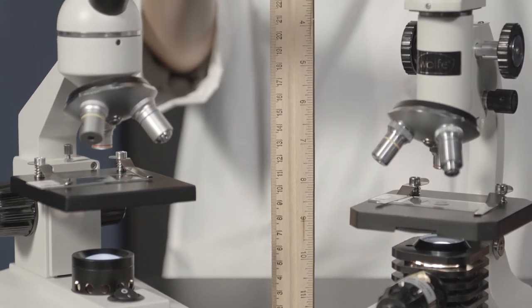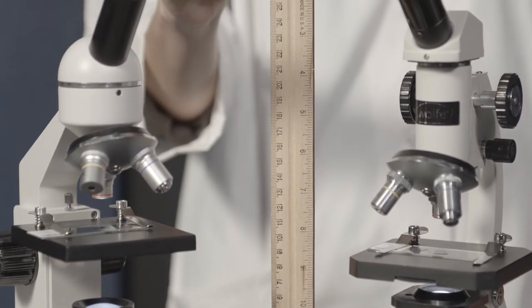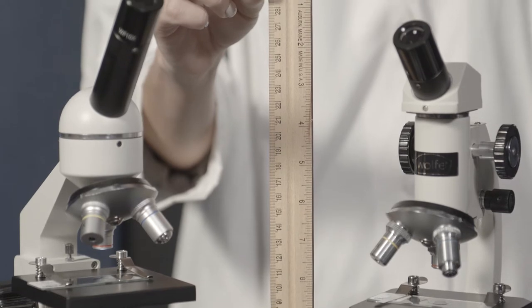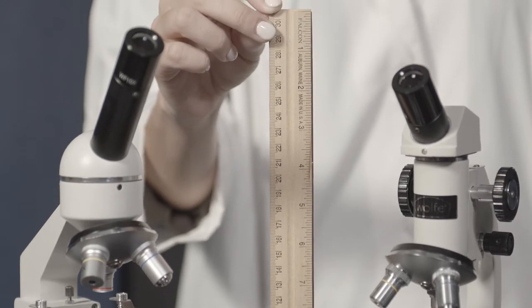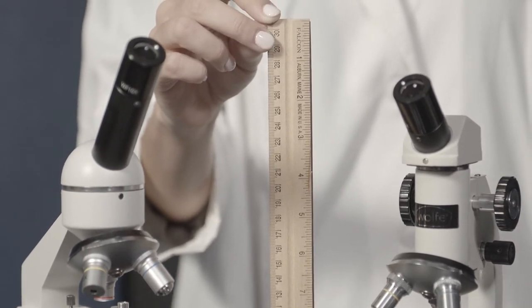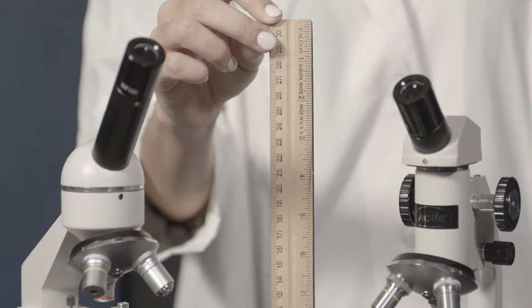Both of the microscopes featured here, the Wolf-Inclined Student Microscope and the Introductory Student Microscope, have the same basic features that are found in many full-sized microscopes.